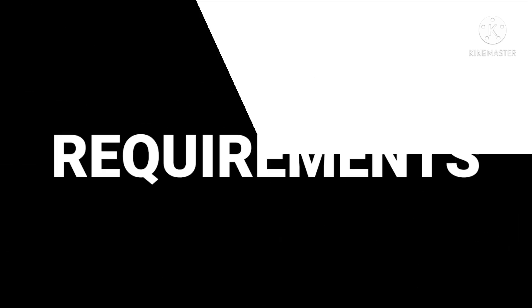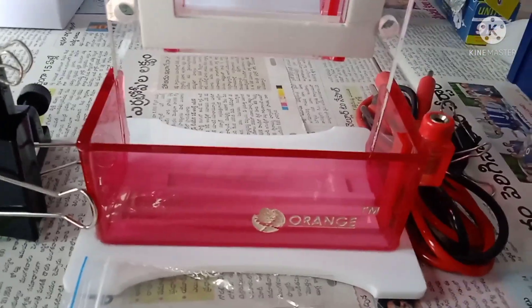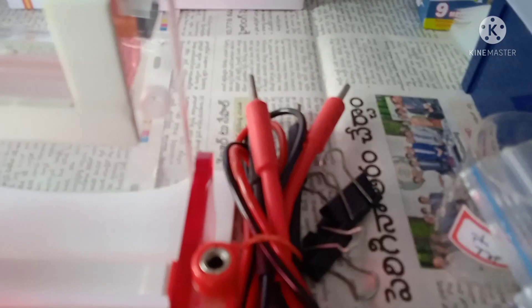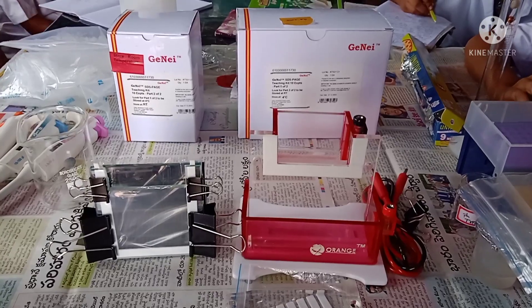Before starting the procedure, let's see what are the required chemicals and materials. In this procedure we are using the Geni kit, which contains two parts: Part One and Part Two. Apart from this, we are also using a vertical electrophoresis chamber, a vertical glass gel cassette, a comb for making the wells, and wires containing the anode as well as the cathode.